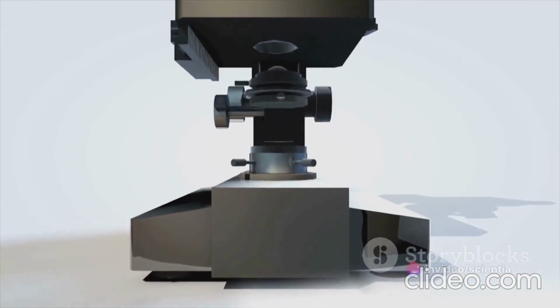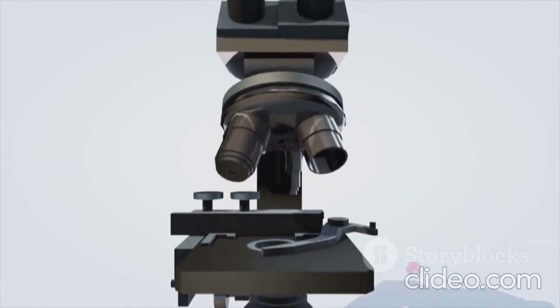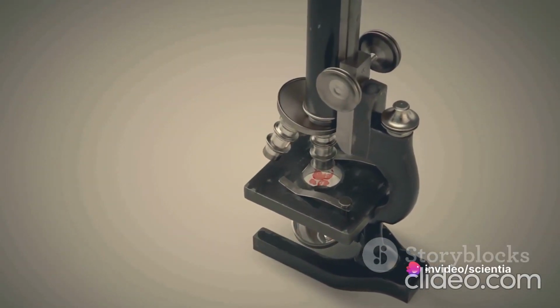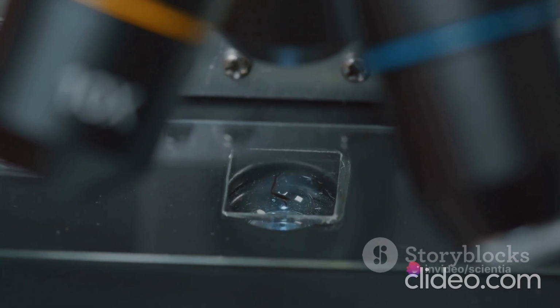In the 20th century, the electron microscope was introduced, which uses a beam of electrons instead of light to magnify the sample. This microscope, with its superior resolution and greater magnification power, has opened doors to the world of virology. It allows the visualization of viruses and the intricate structures of cells, providing a deeper understanding of disease processes at a molecular level.